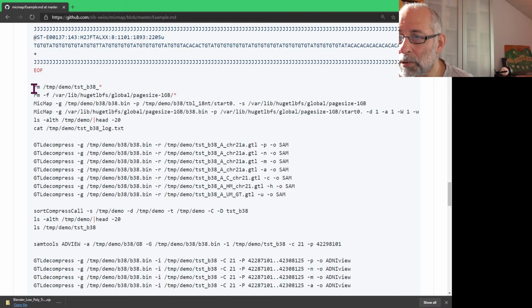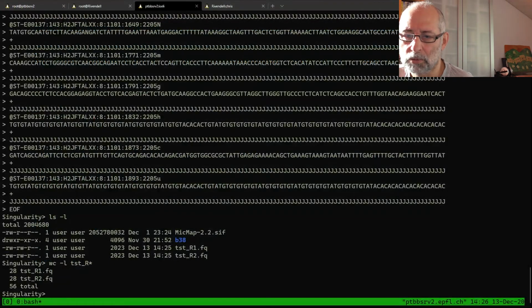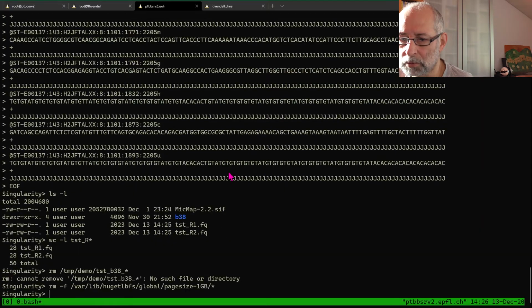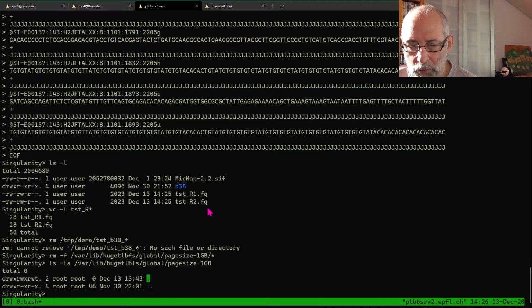So this is just to clean up two things, copy just to make sure we have no leftovers. Okay. We are good.